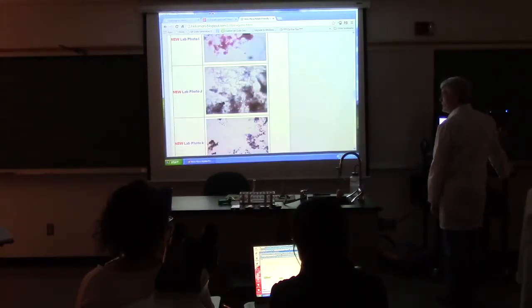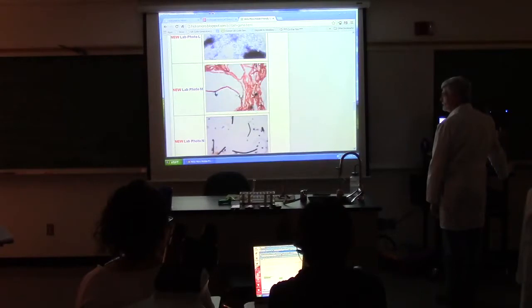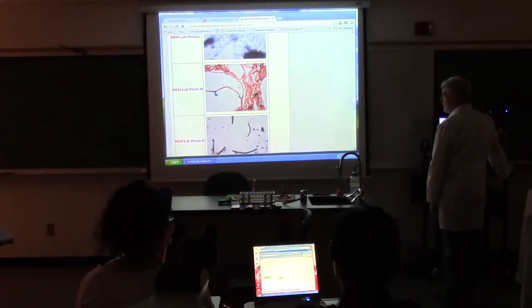This is endospore. What is it? Endospore negative. What's this? Gram. White, pink. Purple and pink. What's this? Endospore, because you've got green and you've got pink. You have rods? Yep. Do the rods have holes? Yep. So it's positive.